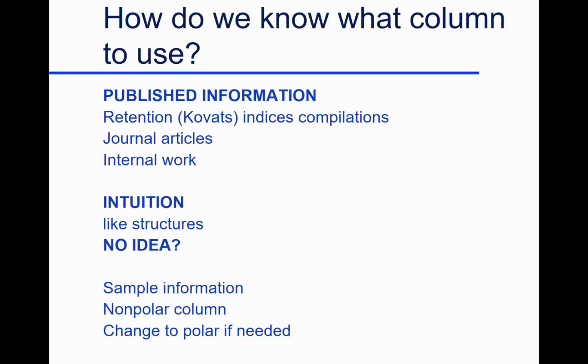When you mix them together, you find that the compound you want to identify runs between hydrocarbon 6 and hydrocarbon 7. I can interpolate between the two, and maybe it runs at 6.82. So it's between 6 and 7, close to the 7. I can go in books and look that up. It also gives some idea of where things elute, where they come out in your gas chromatogram.